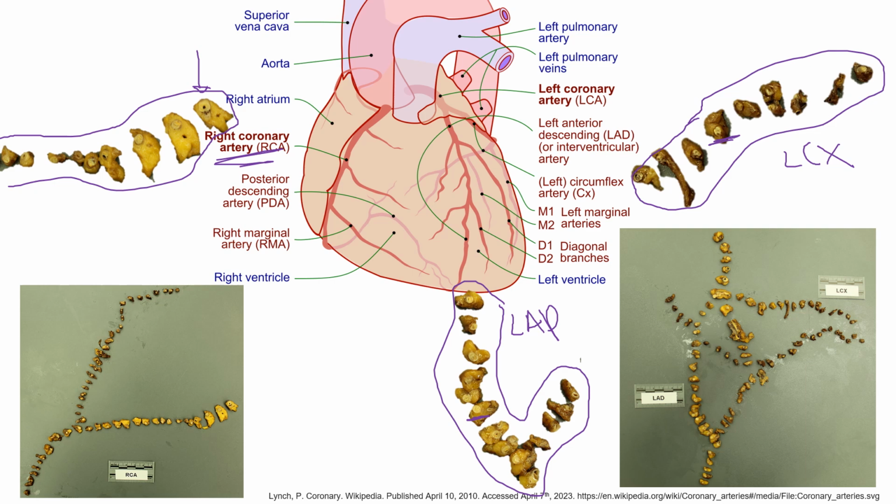In the images on the gray board here, this is kind of a method we apply for bypass grafts. This is something we'll tackle more closely within the autopsy service, but you can see how complex these get. So this is the left main, going into the LCX, going into the LAD. We have a graft that also comes kind of across, feeding probably one of the obtuse marginals, as well as we are seeing the LAD bifurcating into one of its branches as well, and just how complex these dissections can get.